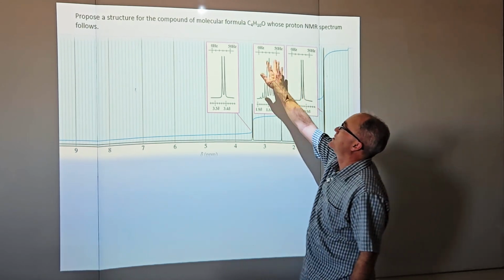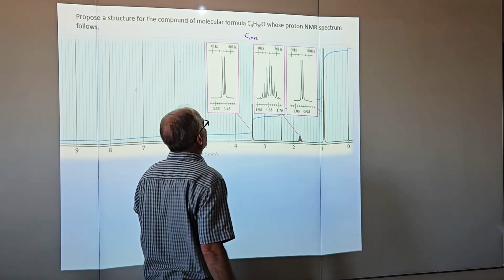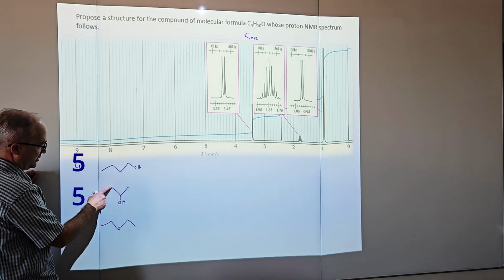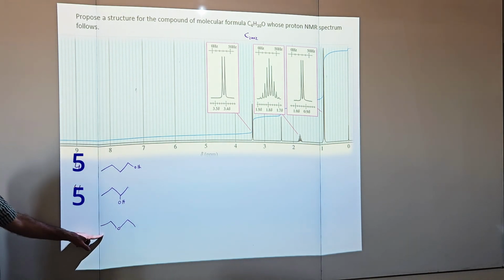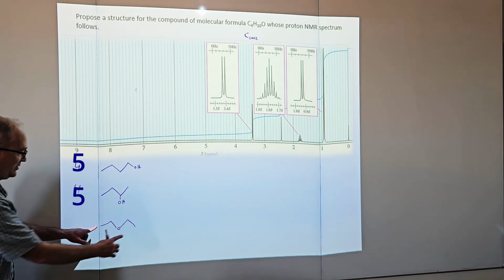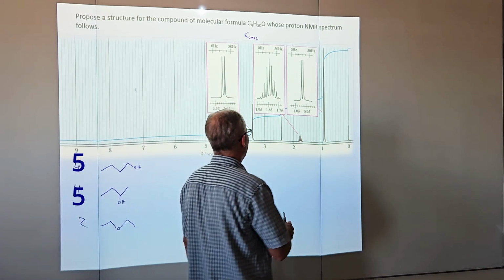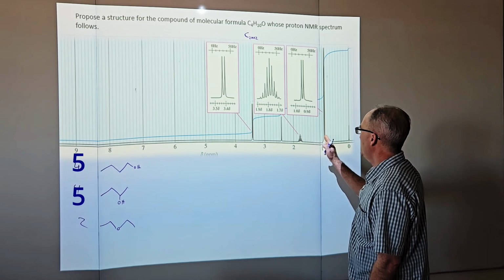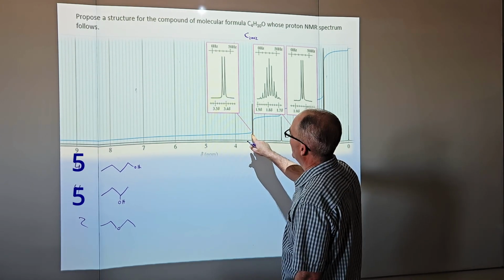So when I look at this, first thing I do in my brain, I go 4 times 2 is 8. 1, 2, 3, 4. How many signals is this going to have? Just 2. These are equivalent. All right, and how many signals do we actually have? 1, 2, oh man, 3, 4.